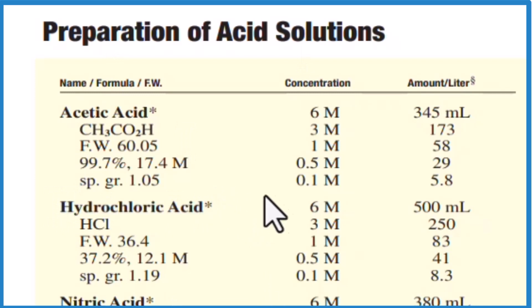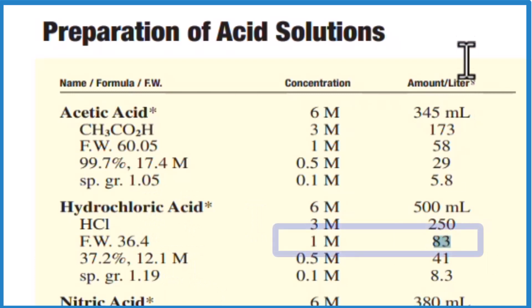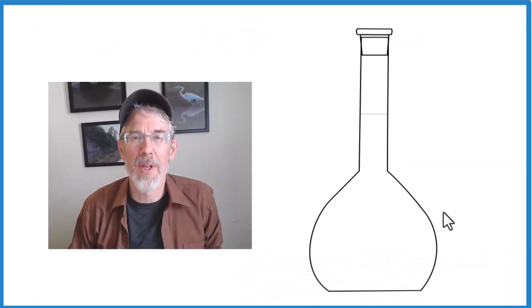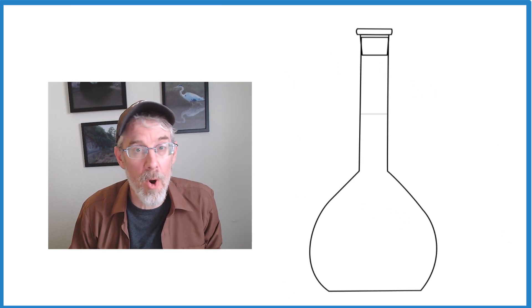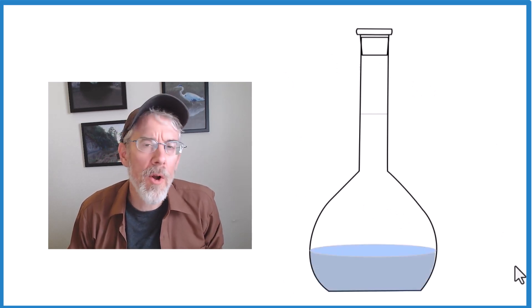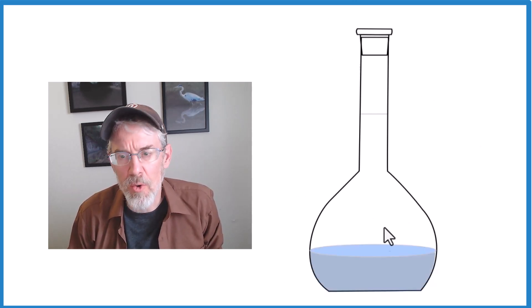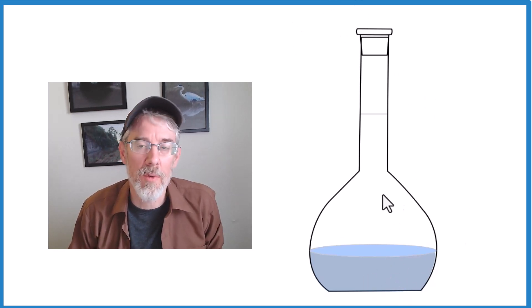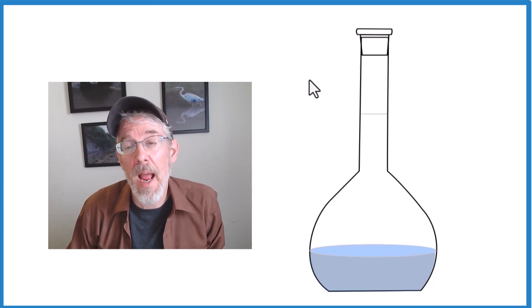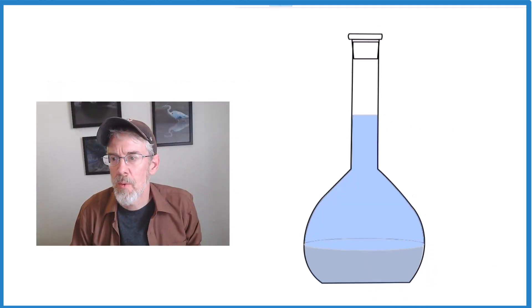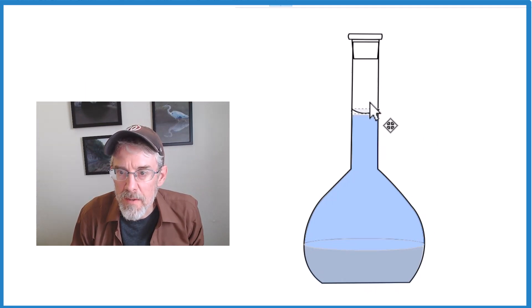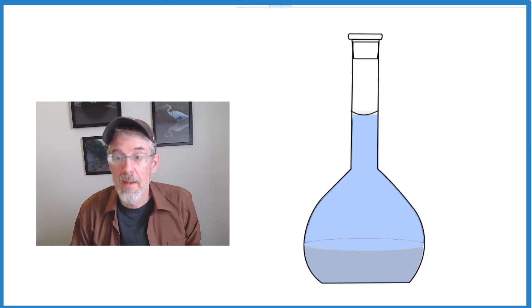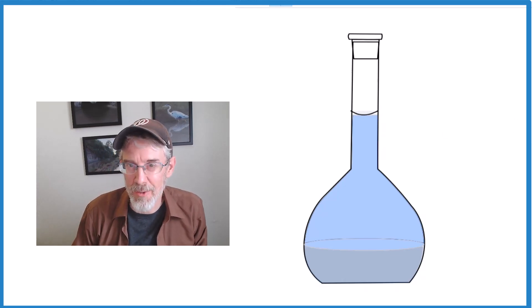If you have concentrated hydrochloric acid, it's right about 12 molar, and you need 83 milliliters in one liter to make that solution. So we get our one liter volumetric flask and add some water first, because once we add that concentrated hydrochloric acid it can get kind of hot. We swirl that around, then add water up to the mark so the meniscus comes right to the line. That's a one molar solution of hydrochloric acid.